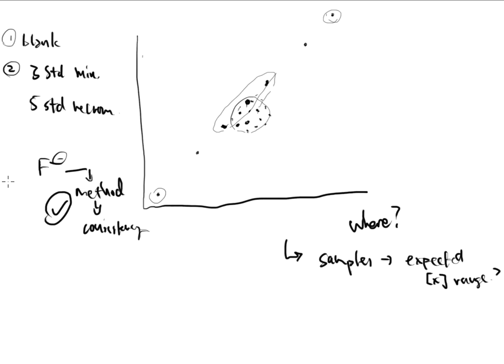If we're analyzing an orange juice sample, or a hamburger bun sample, or soil that was pulled from Greenfield Lake in downtown Wilmington, we probably have some insight about what to expect or what to find, right? So for instance, if I was looking at fluoride in drinking water, what I would do is go to the EPA's website, and the EPA says that if it's over 4 parts per million, then this is bad news bears. You need to call the EPA and report it, and they're going to come down and do an investigation. So I probably know good and well that these companies that are in control of my drinking water will not have levels higher than 4 parts per million.